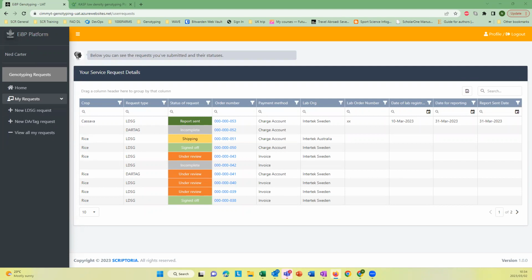Ismael. Thank you. This is very good. I think it streamlines a lot of the submission processes. One thing I wanted to find out is those submission documents that are for import. For example, if you want to send to Australia, there's a certain form which you fill declaring that these samples have been freeze-dried and they adhere to certain regulatory requirements and so on. Can that also be included here so that we don't have to look for that document all the time?